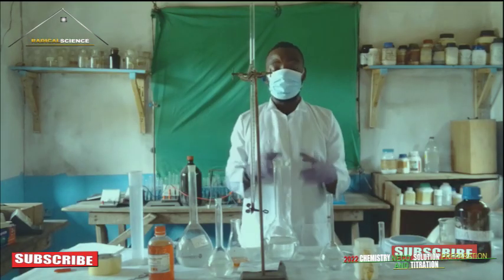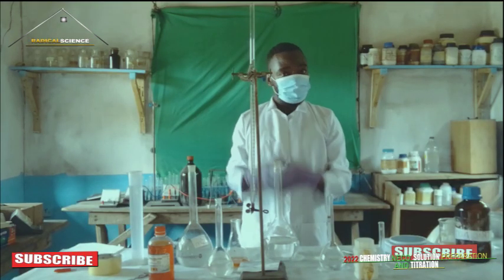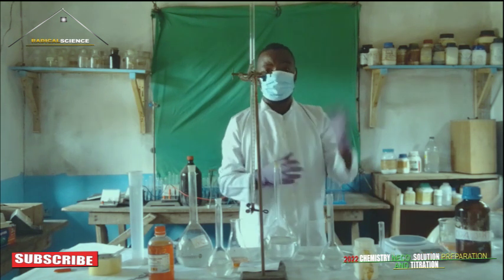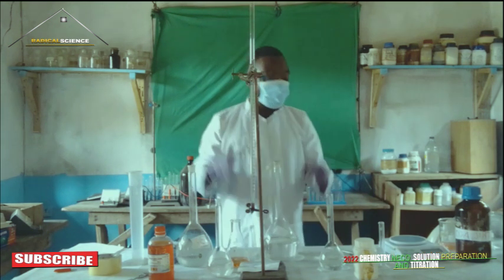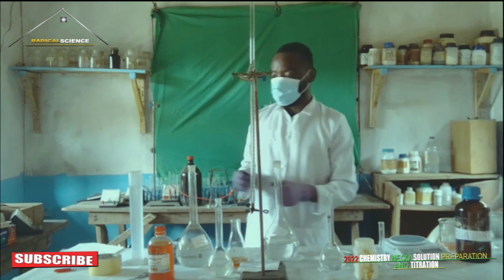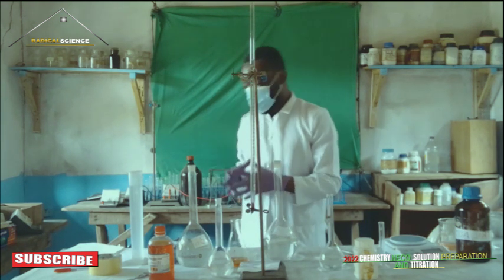On this practical you must follow the instructions the way they are given. We are going to be looking at the quantitative analysis of this practical, which is the titration aspect. But before we go into the titration, we need to know how these solutions are prepared according to the instruction.